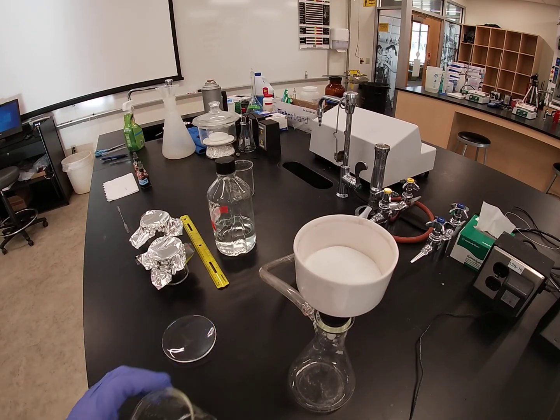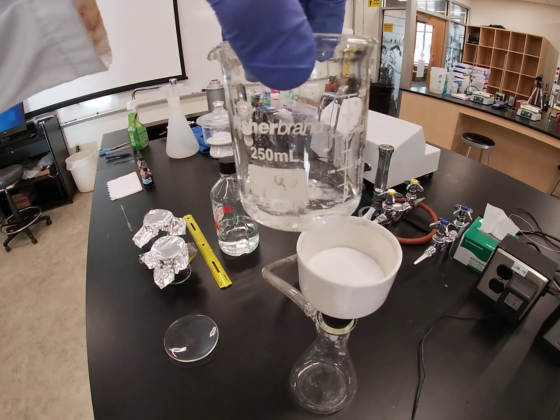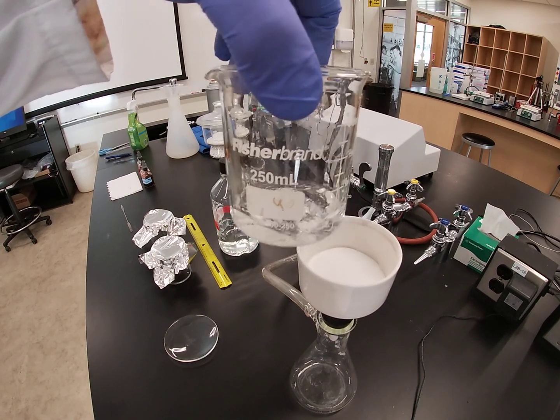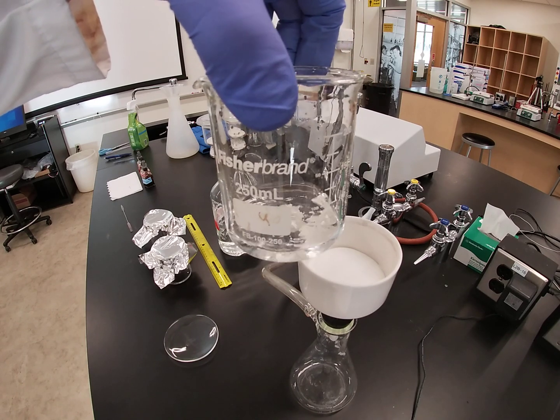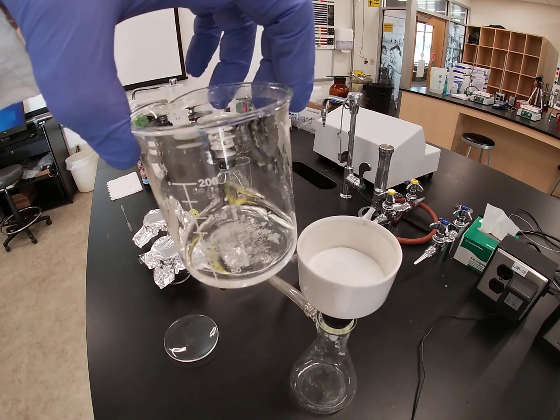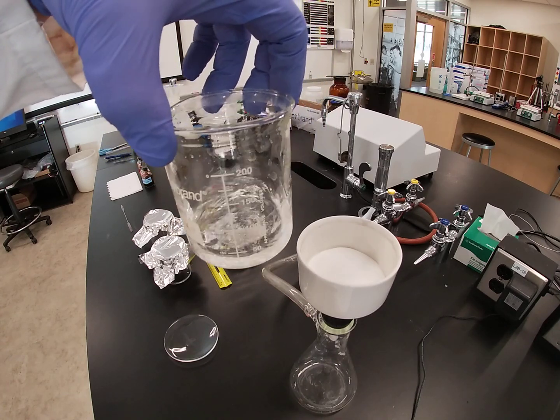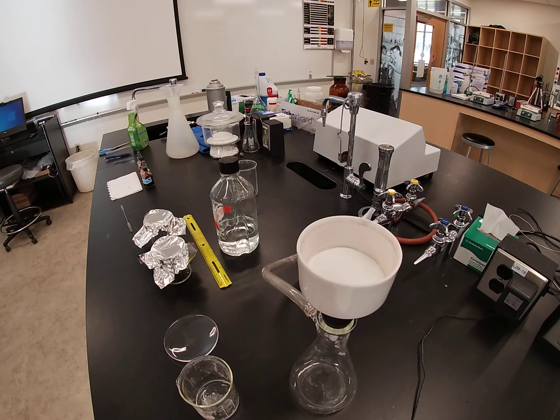Alright, here we are again. Our mixture that was left, which probably has some naphthalene in it because we didn't sublime it very well, was mixed with DI water and allowed to dissolve and mix up really well. And we're going to do a third part here, which would be filtration.